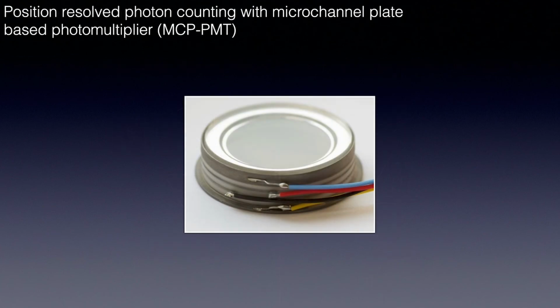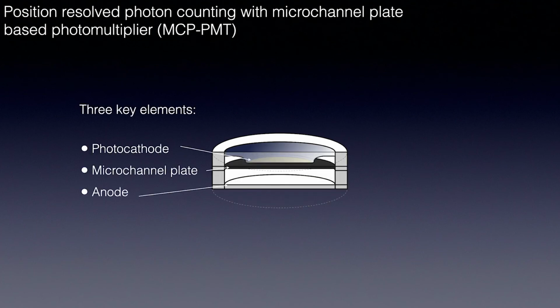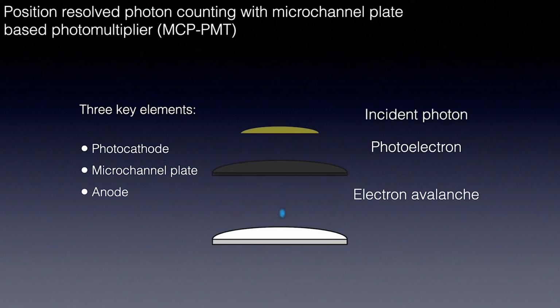In this photo, you see the heart of the LINCam. This is a photomultiplier tube based on microchannel plates, or MCP-PMT. This is a vacuum-sealed ceramic assembly holding three key elements: a photocathode, a microchannel plate, and the anode. How does it work? An incident photon knocks out a photoelectron that is driven by the electric field to the microchannel plate, which acts as an amplifier. The resulting electron avalanche is collected by the anode.